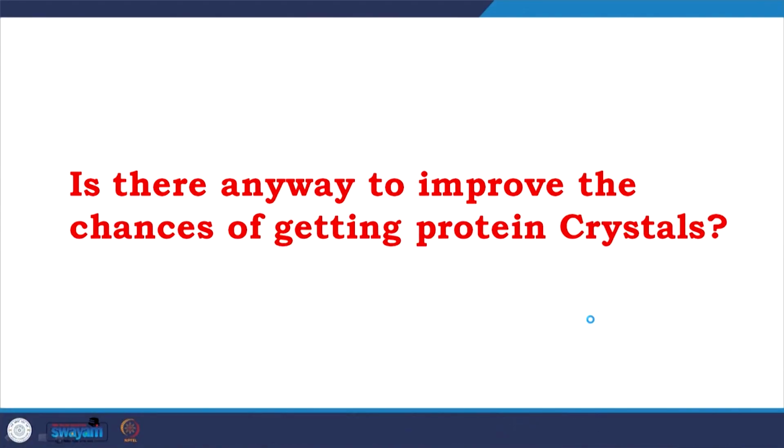So, that is why it is difficult. We get crystals, but there is a chance of around 8 to 10% if you do your other works perfectly. So, is there any other way to improve? We could improve those chances, because you are thinking, I am going to choose my career to be a crystallographer, but if I do everything correct and do not get crystals, what will happen? It is not actually that bad.